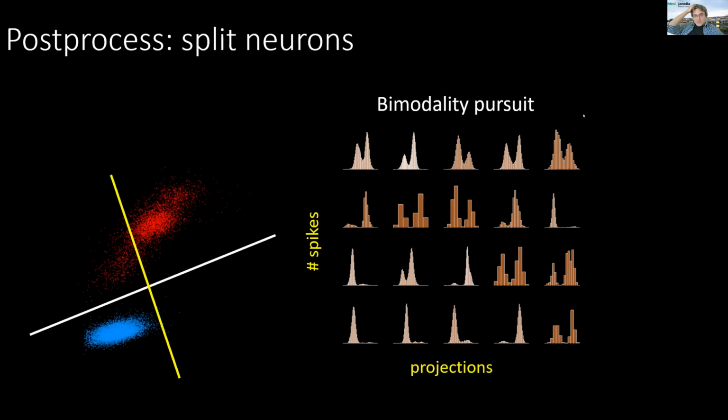Difference between template and feature visualization is something that Nick is going to go over when he talks about Phy.